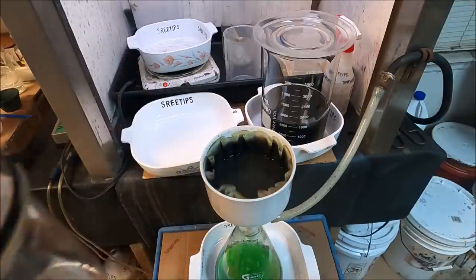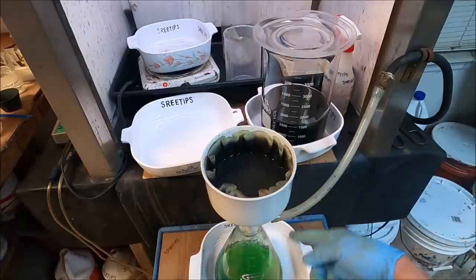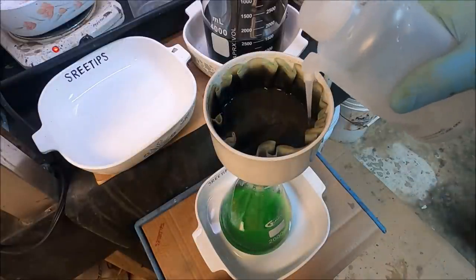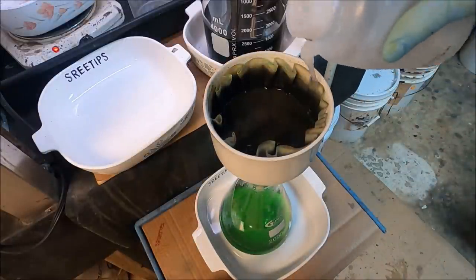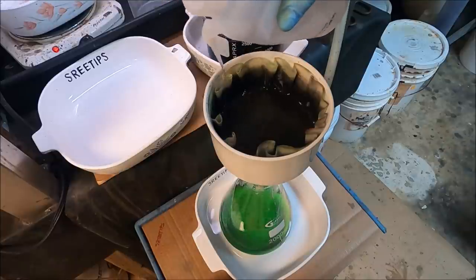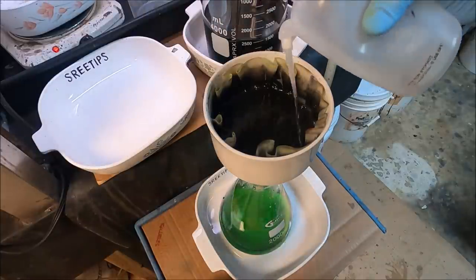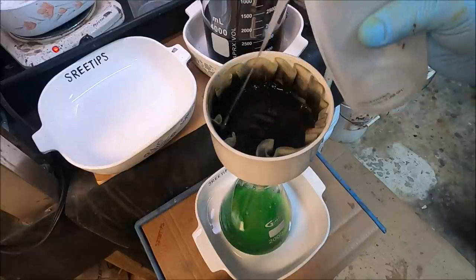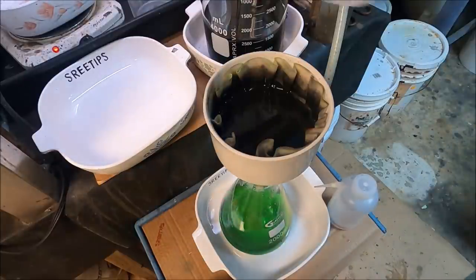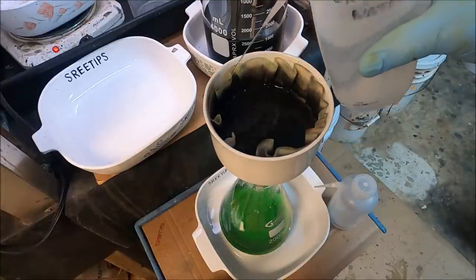Run it back through. But right now, what we're going to be concerned with is getting the platinum group metals out of this solution here with dimethylglyoxime. I'm going to rinse the filter real well here to get all the silver out of that filter, because what we'll do with this black material in the filter is dissolve it in aqua regia. If there's a bunch of silver in here, it'll react with the hydrochloric acid in the aqua regia, form silver chloride, and cause problems for us.